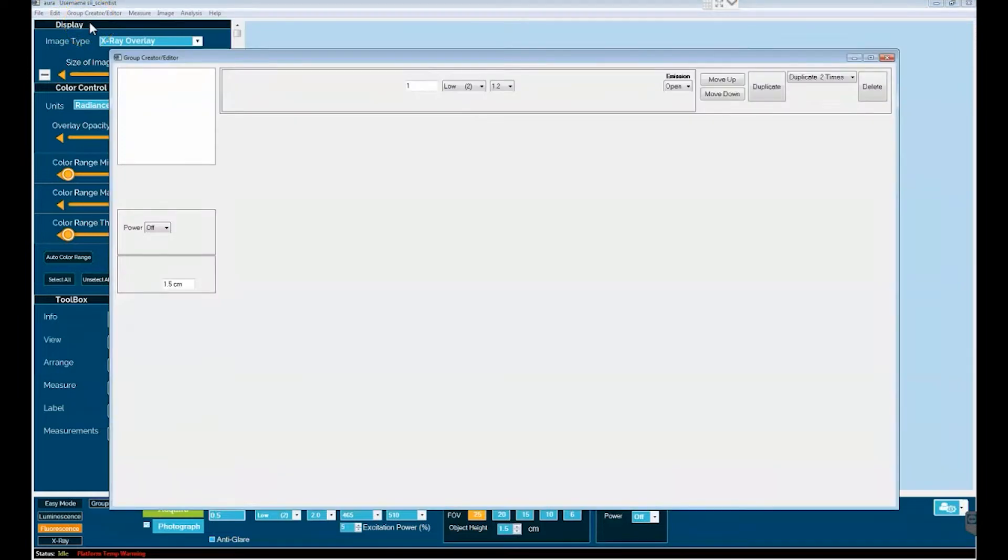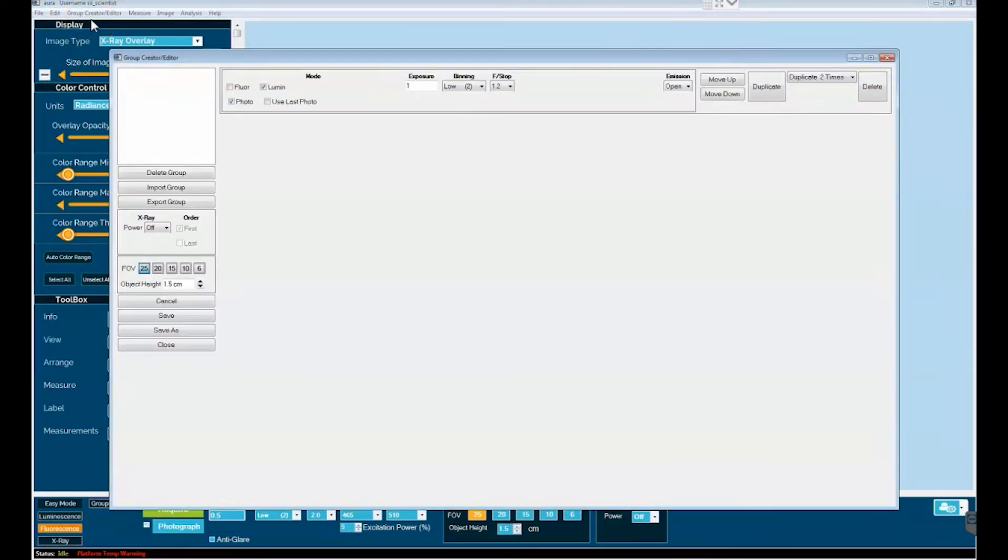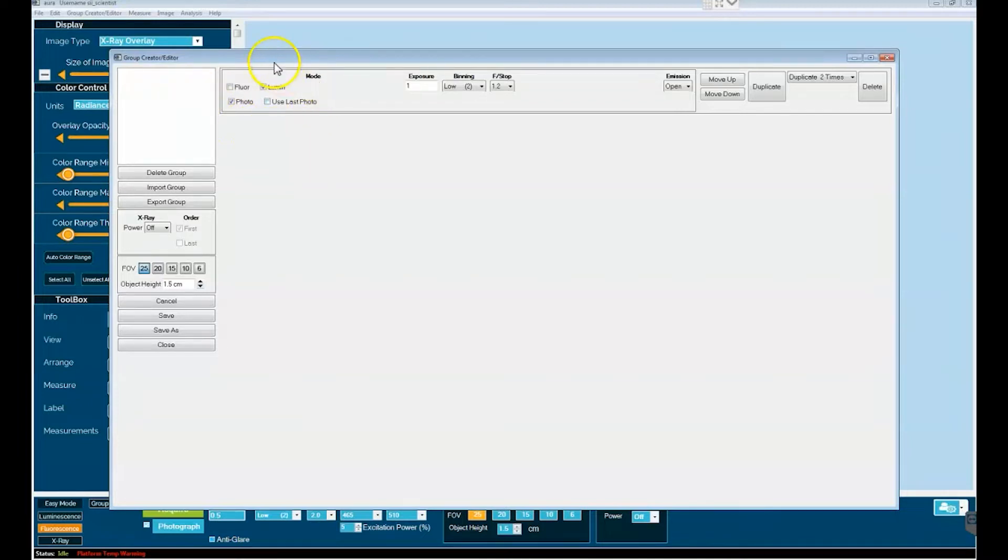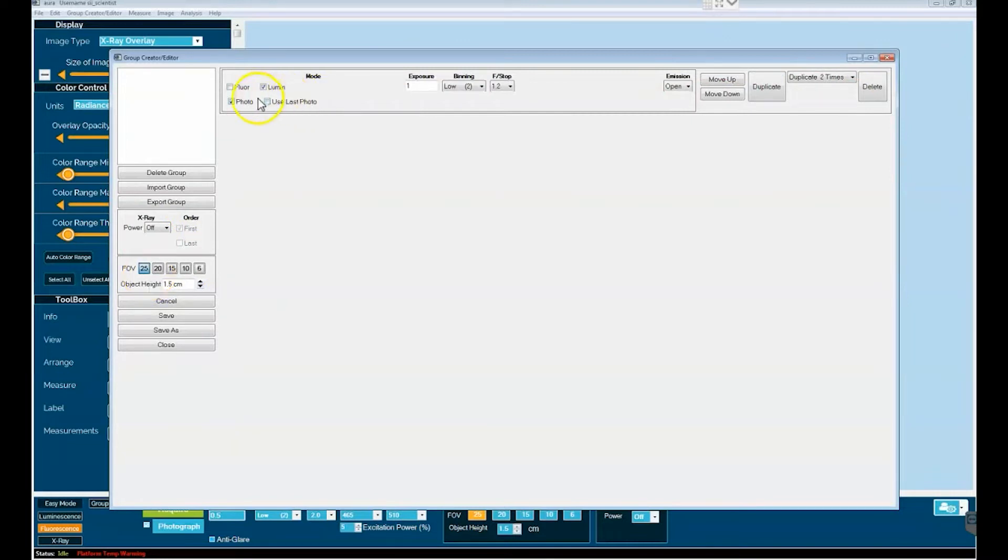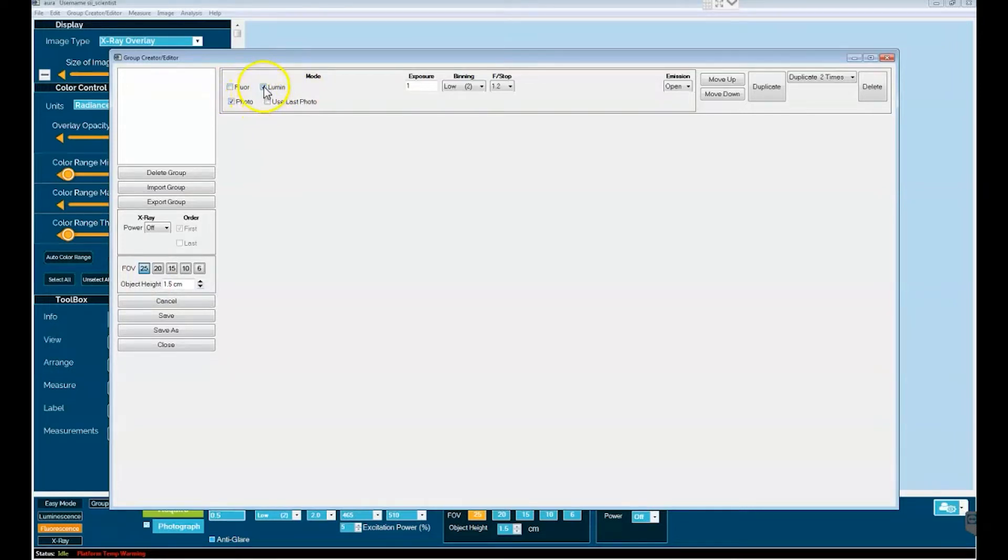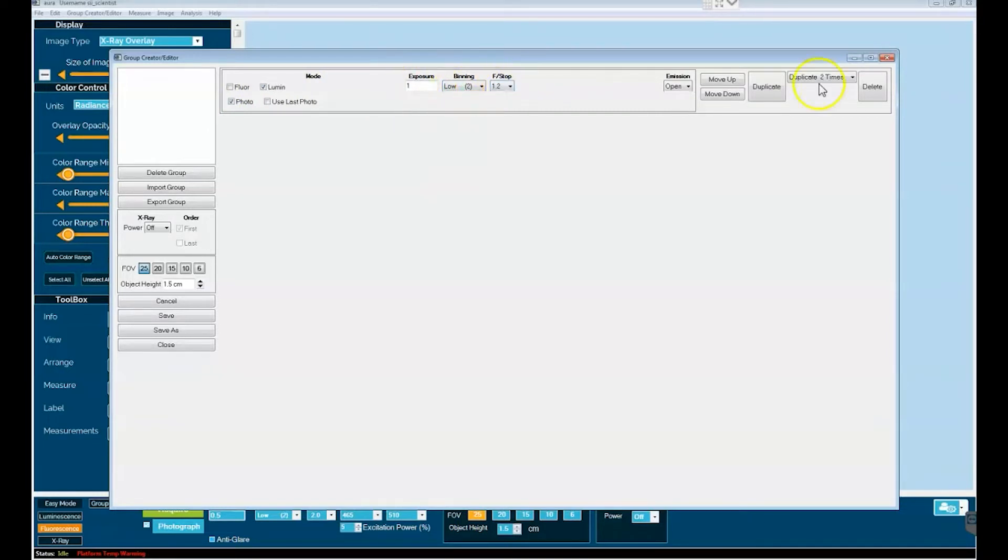This will open up a secondary window off of the primary window of Aura and this is the Group Creator Editor window and in it you can set up and define multiple image acquisitions with many of the settings set up in the middle box while the value for x-ray and FOV parameters can be set up off to the left. Along the top you select either fluorescence or luminescence and in our case let's go ahead today and do luminescence. We'll do just a default one second exposure with two by two bin f-stop 1.2.